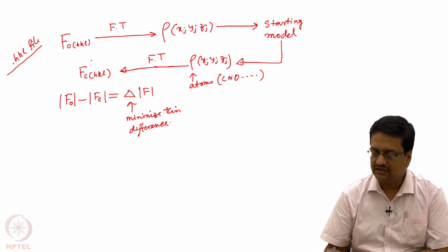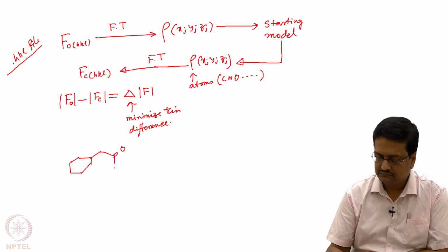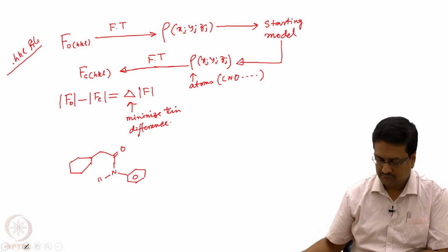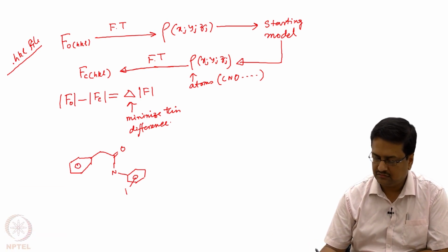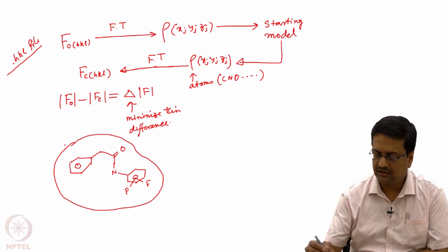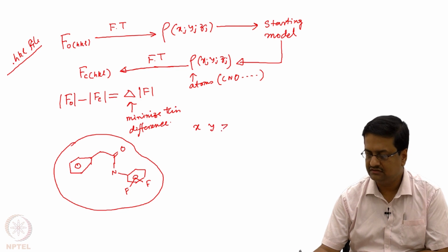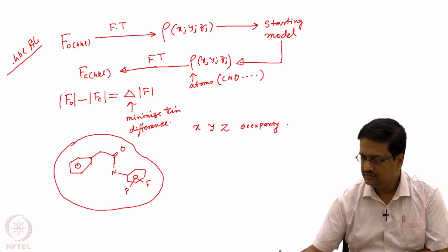So once we have done all that, and our desired molecule is visible, and the atoms' bond connectivities are reasonable, what we at this point have are the corresponding x, y, z coordinates for all these atoms, their occupancy, and isotropic thermal parameter.